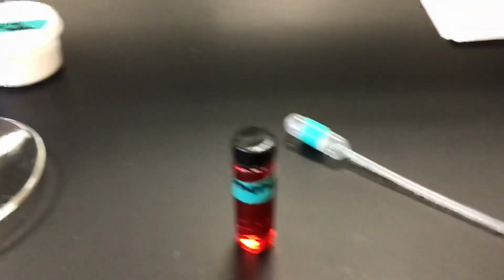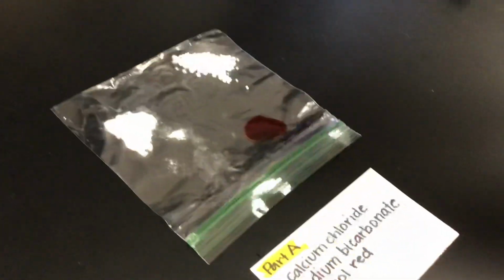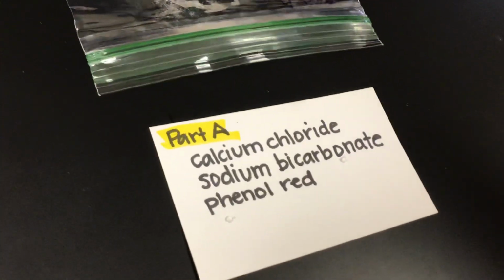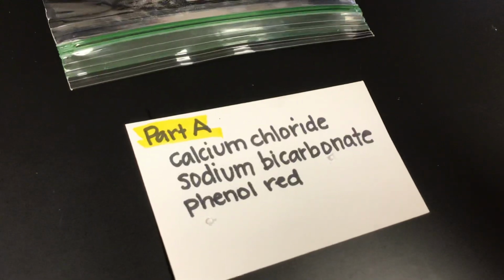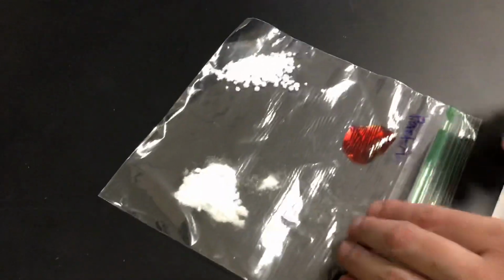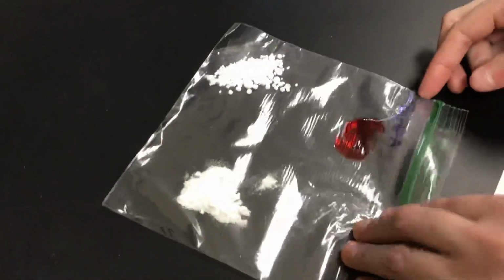All right, so I'm going to come over to Miss Blankenship. In your lab handouts, under part A, so we are on slide number 3, we're mixing calcium chloride, sodium bicarbonate, and phenol red together in our plastic baggie. So here is what it looks like before we mix. And Miss Blankenship's going to go ahead and mix for us.